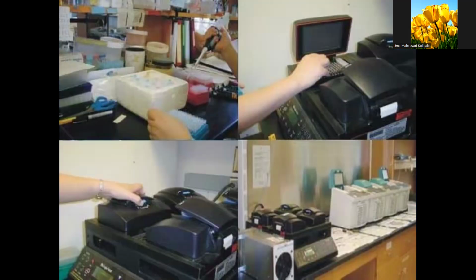We take all the requirements, buffer solution, Taq polymerase enzyme, primers, and the already existing DNA strand, our desired or targeted gene fragment, into the thermal cycler tube, and this tube we place into the machine, and we maintain the temperatures.